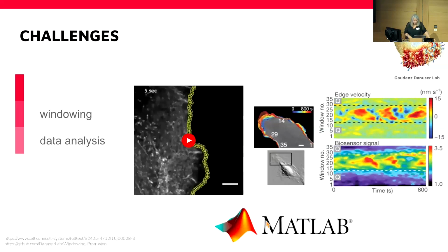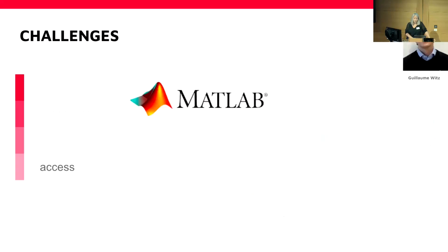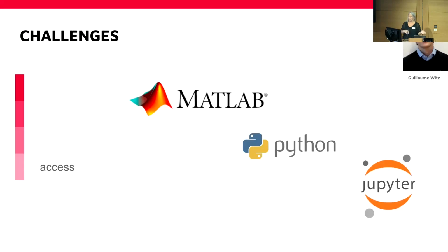it was in MATLAB. So to make it more interoperable, Guillaume Witz, who is, I would say, our orchestrator, so he is coordinating all this work that we are doing, did a lot of work to transform this into Python, because we are now in a quite Python-based world and we wanted to make it interoperable. So he built a lot of Jupyter notebooks. And you see that the analysis is quite complex. So he started sharing these long Jupyter notebooks. Then he divided it into many Jupyter notebooks. And then, yeah, biologists got very scared and didn't use it.